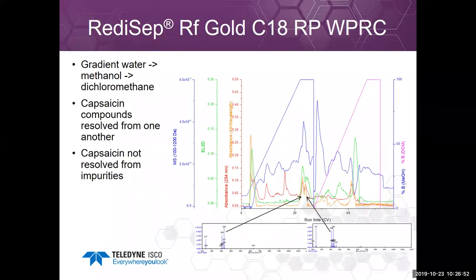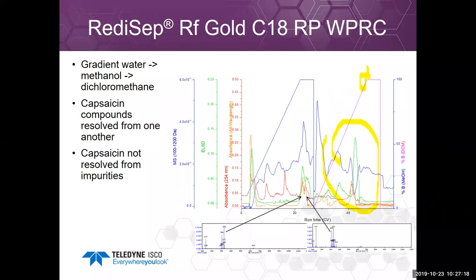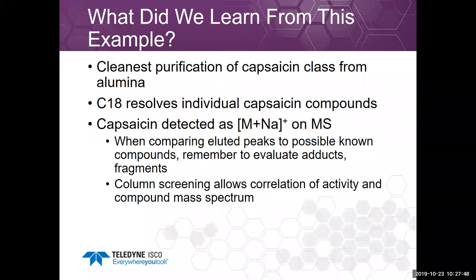Looking at the reverse phase wide polarity range on a gold C18 column, I ran a gradient from water to methanol, then methanol to dichloromethane. The dichloromethane washes off very nonpolar compounds and also helps clean the column. We still see many compounds coming off in this methanol-to-dichloromethane portion — this is an example of non-aqueous reverse phase. What we find is that the capsaicin compounds are well resolved from one another, but there are impurities that also co-eluted.